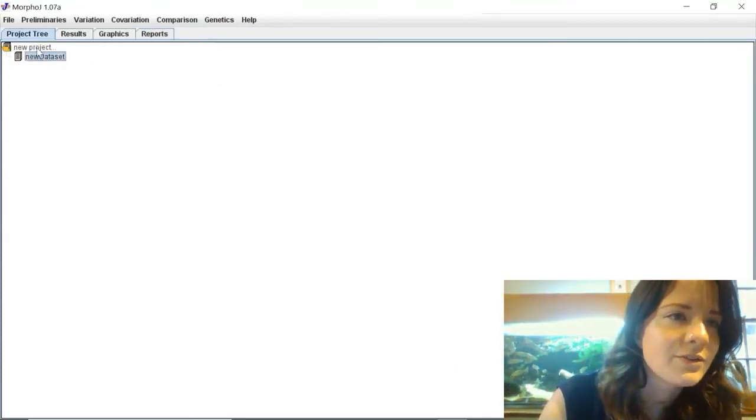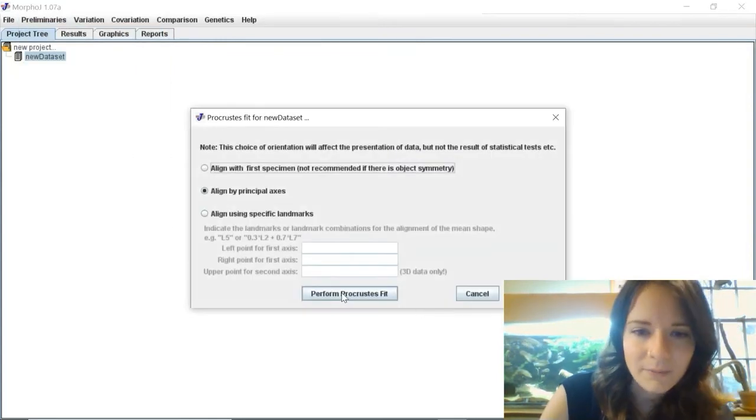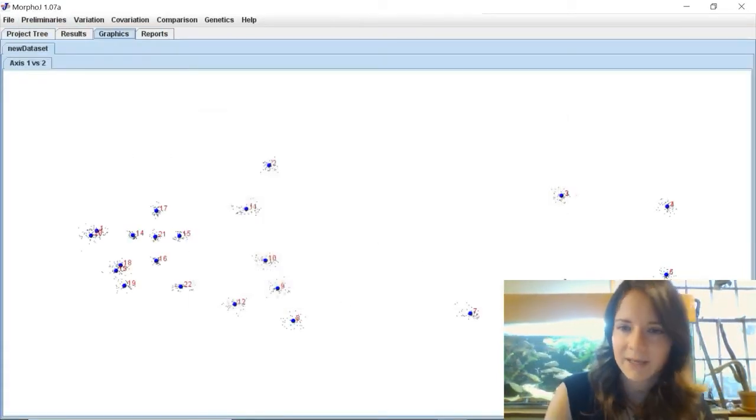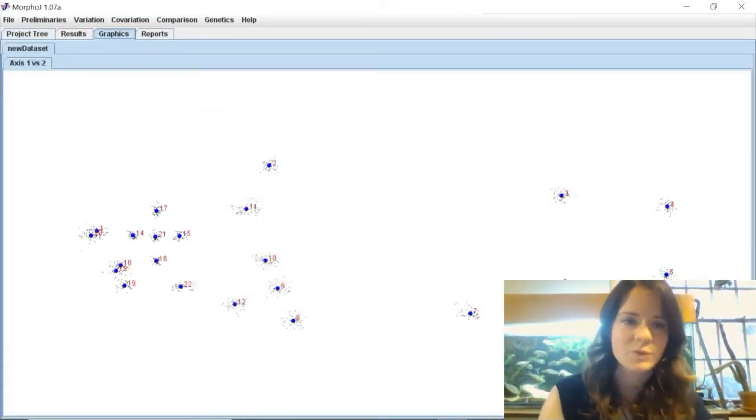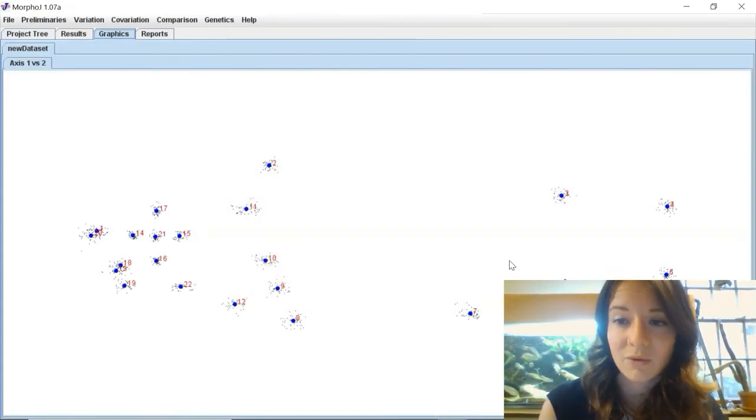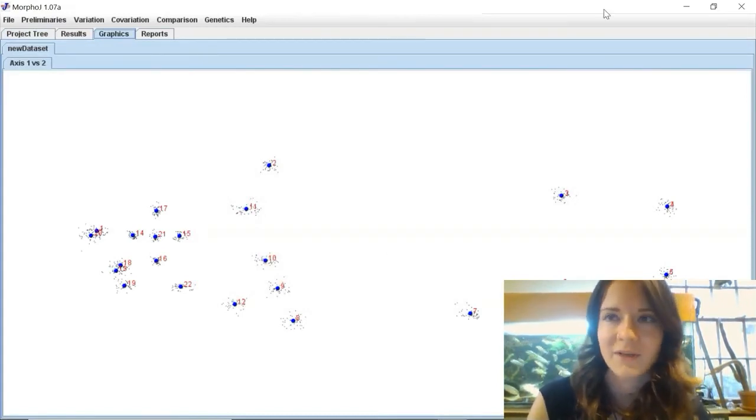Just to show that, I'll just do a little Procrustes fit and you can see here all the landmarks all sorted. So yeah, I'm not sure of the actual cause of this problem but it is a simple fix.